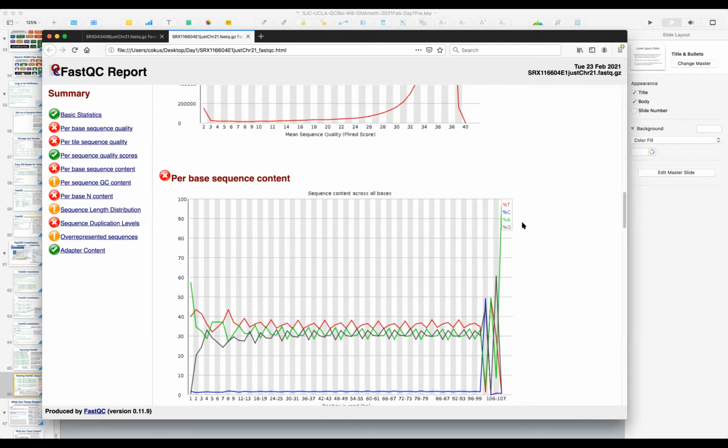But I'm just wondering if you had, say, an experiment with lots of different data sets, and then say 20% of them require you to trim away a substantial amount so that the read lengths are, say, 80 versus the remaining 80%, which are good across approximately 100 bases. Is it fair, therefore, to combine the analysis looking at samples that have different read lengths like that? So 80 versus 100, not too bad, right?